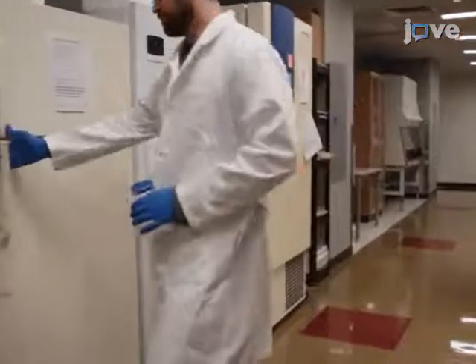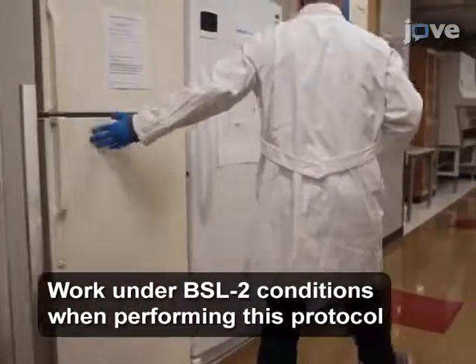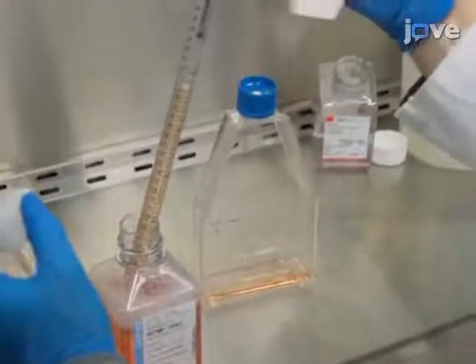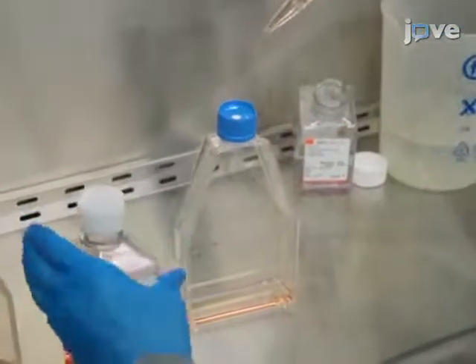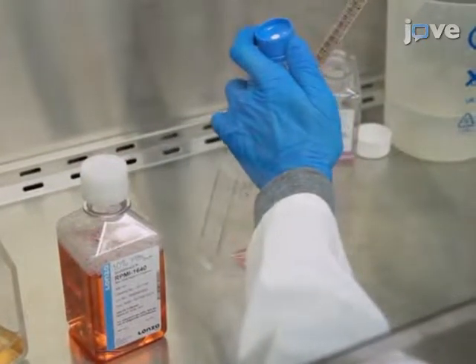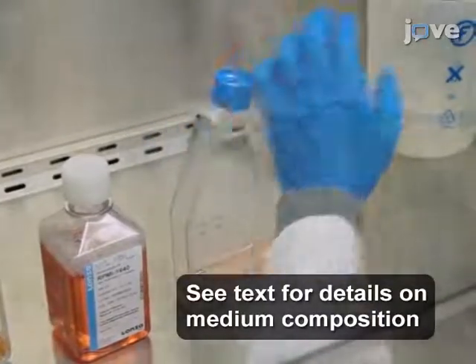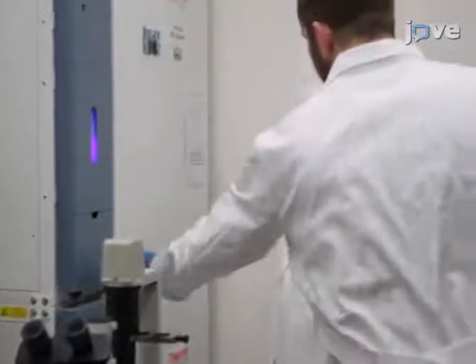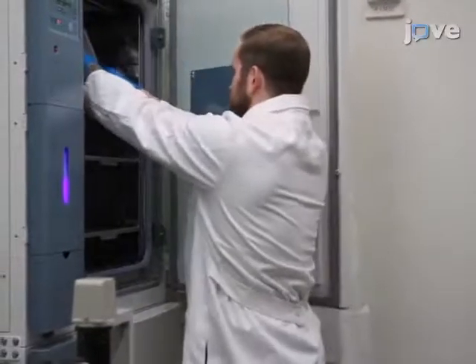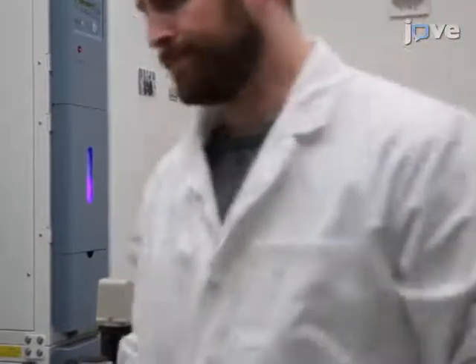To begin, prepare and filter sterilize TNE buffer as described in the text protocol, then store the solution at 4 degrees Celsius. Culture the KSHV positive EBV negative primary effusion lymphoma cell line BCBL1 in a T150 flask filled with 60 milliliters of RPMI medium. Maintain the cells at 37 degrees Celsius, 5% carbon dioxide, to obtain a suspension of approximately 1 to 1.2 times 10 to the 6 cells per milliliter.